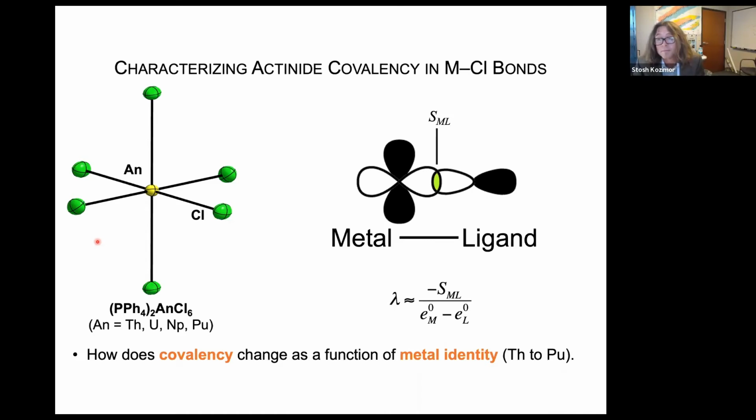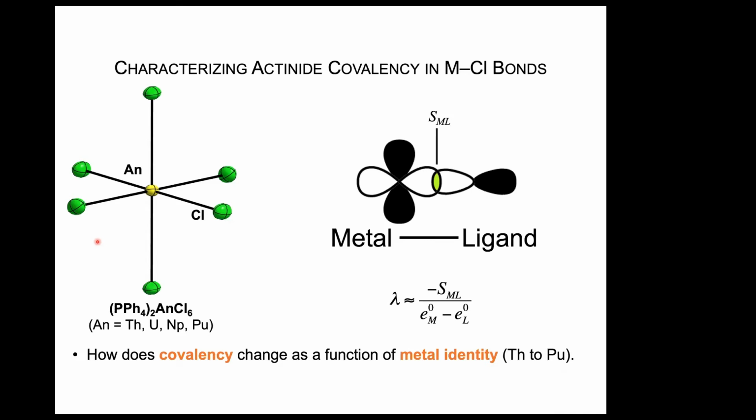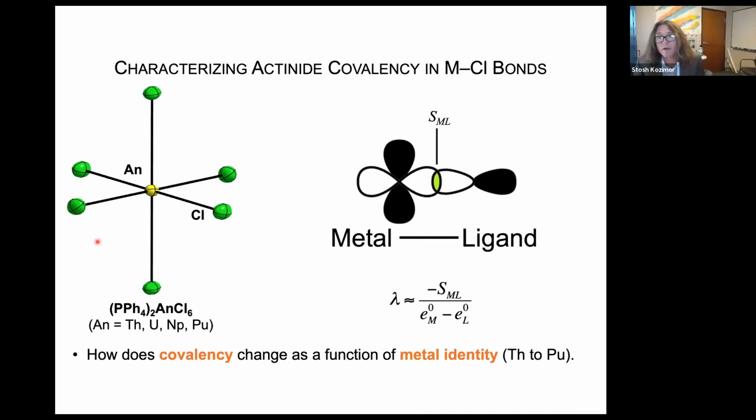Okay, so I guess you have to deal with overabsorption because penetration depths are pretty small and down at chlorine. Yeah, so they're very dilute. These measurements are made on very dilute samples. We've quantified, or at least we've demonstrated, that we don't have self-absorption with the fluorescence measurement. So there was a lot of work that went into that.